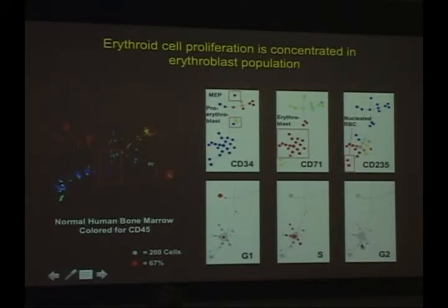And I think I mentioned to some of you guys yesterday in my group that G2 populations in these in vivo assays tend to be quite small. And if you look at other publications of normal cells like ES cells or in vitro derived cells where cell cycle analysis is done, again, they see the same thing, that the G2 population is quite small, much smaller than what we see in cultured cancer cell lines, where I believe probably most of the G2 cells you're seeing are actually G2M arrested cells.